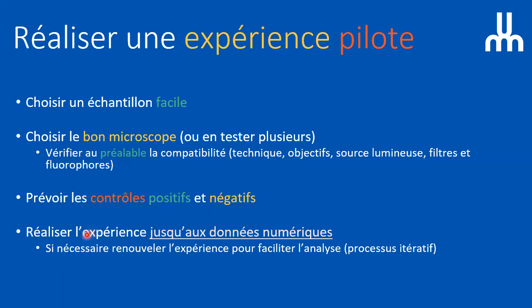If you do your pilot experiment, do it until you get the numerical data. Some people just go to the microscope, take some images, look at the image, and say, oh, it looks good. No, that's not enough. You have to analyze, and this will be in sessions 2 and 3, until you get numerical data, just to have the graph, or just to understand if your picture is good enough to get numerical data. If it doesn't work, then you can modify the way you acquire images to get the data you want. Sometimes it's just easier to change the way you do your acquisition to better fit the analysis. It's too hard to have a lot of data that you cannot analyze.